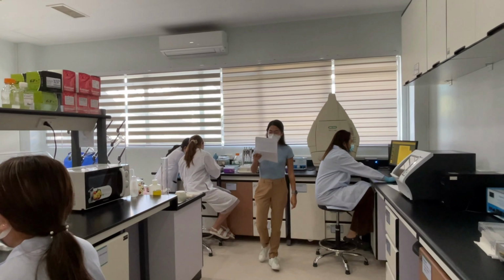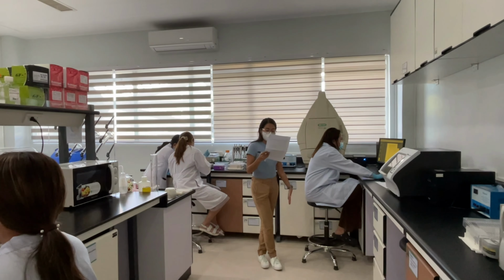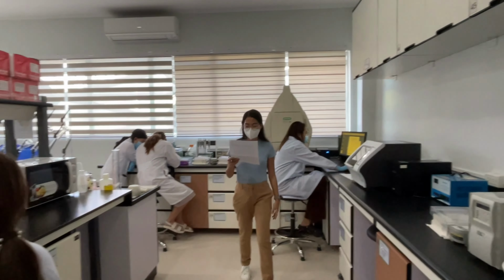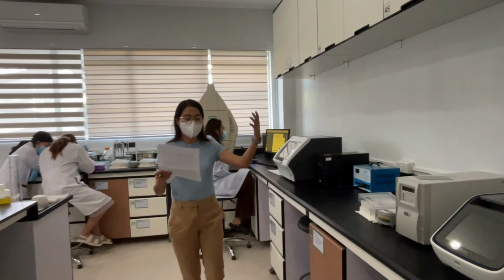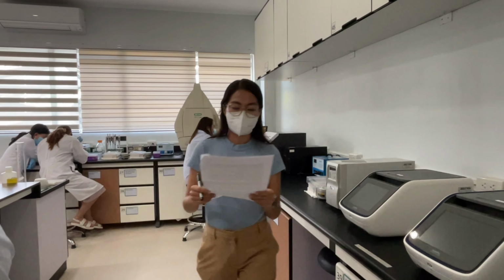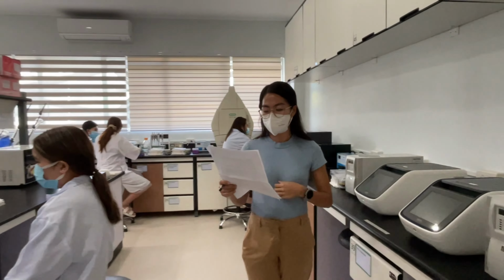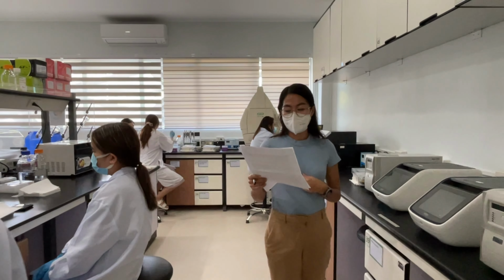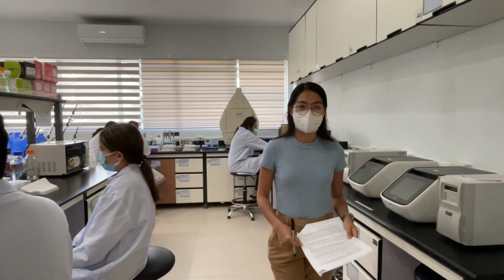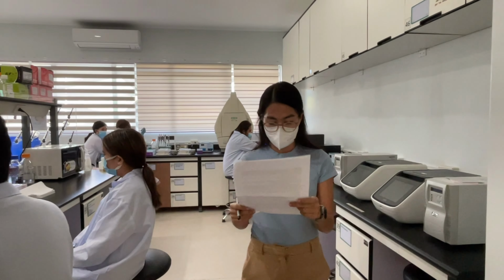Okay. Ang Biorad. We house in this room our gel documentation system, automated RNA extraction machine, and thermal cyclers. Room 2 is used for different purposes like DNA and RNA extraction, and DNA and RNA quantification, and viewing of nucleic acid samples and cDNA amplification.